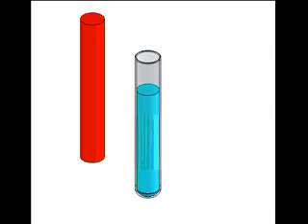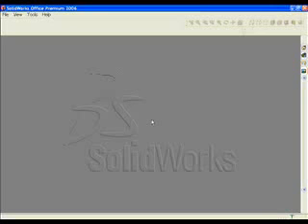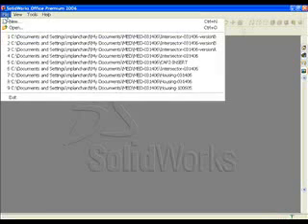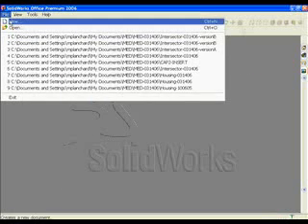The first part we will create is a cylinder. The cylinder represents our overall shape of a test tube. That's our goal. Create a new part. Click File New. Select Part.